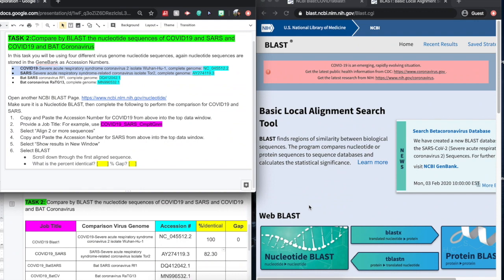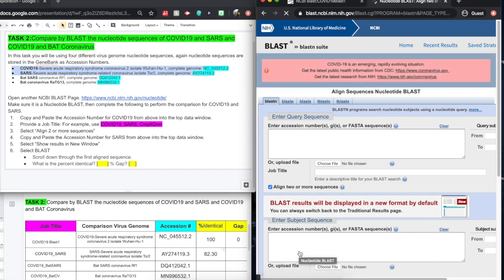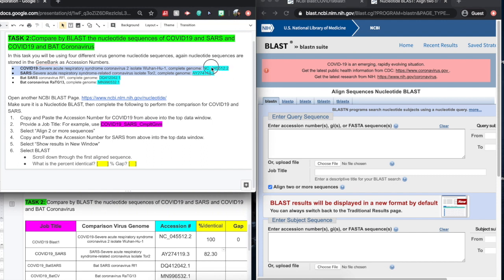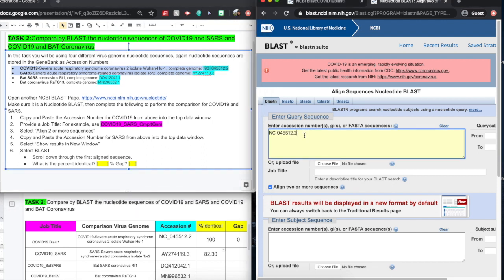For task two, we're going to open up another nucleotide BLAST window. We want to be able to compare two sequences here. So we're going to start with our original COVID-19 accession number. Copy and paste that there. And then we're going to select the SARS accession number.